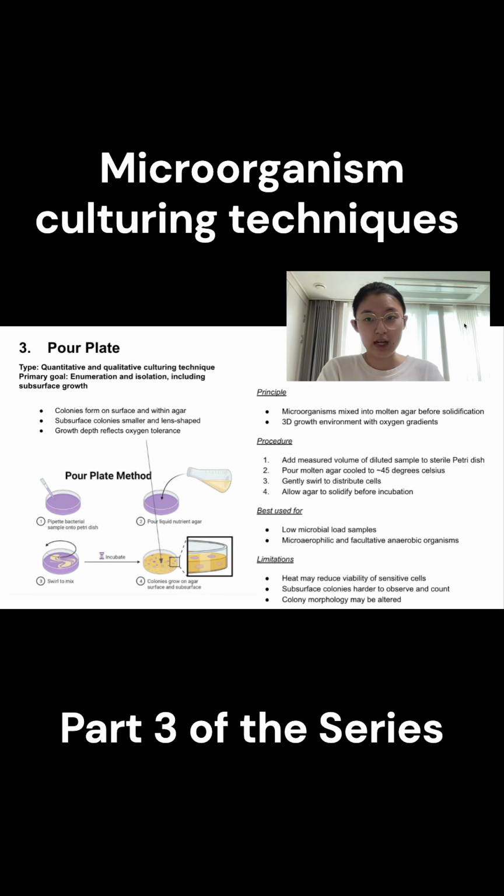In terms of the limitations, the first limitation is that the heat from the molten agar can reduce the viability of heat-sensitive cells, and subsurface colonies are harder to observe and count, and the colony morphology can look a little bit different because the growth conditions inside the agar aren't necessarily the same as on the surface.